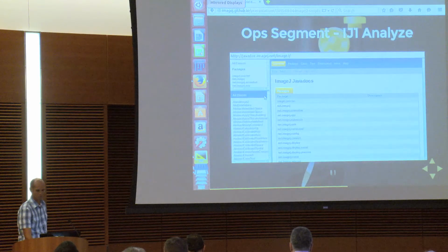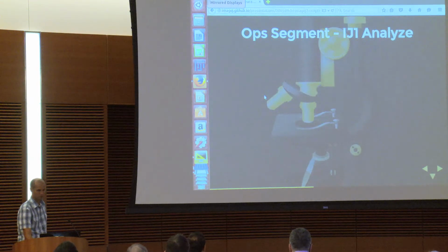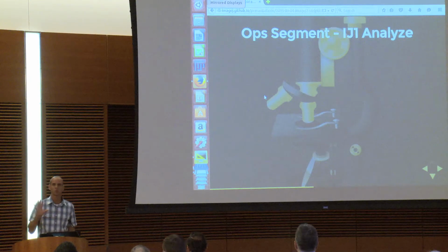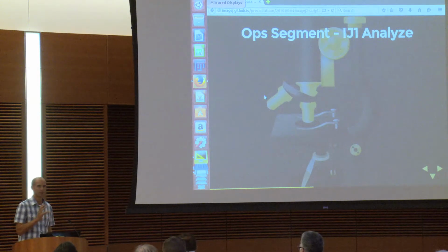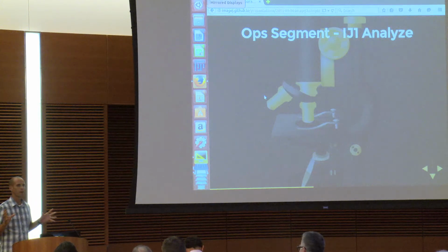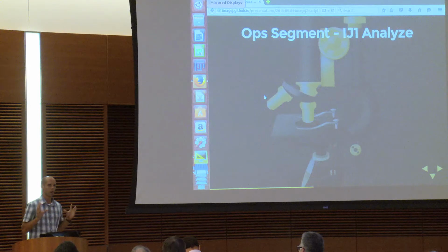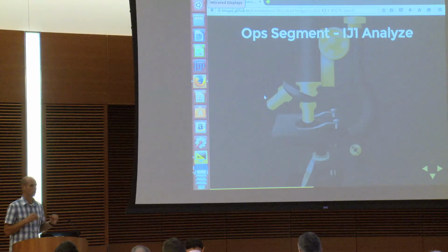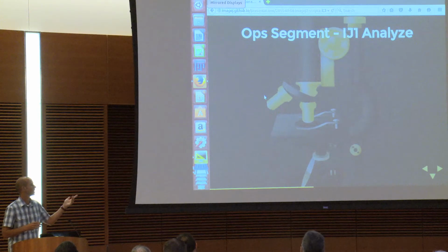Okay, so the next thing we're going to do. I think this is a really, really important example here. Maybe the most important one, because we're going to segment an image, and then we're going to use some of the classic ImageJ1 functions to display a results table. So in the future, Ops will be capable of having some more sophisticated results and ROI processing functions. So this will, in the future, become outdated.